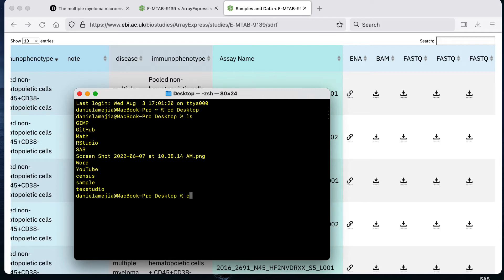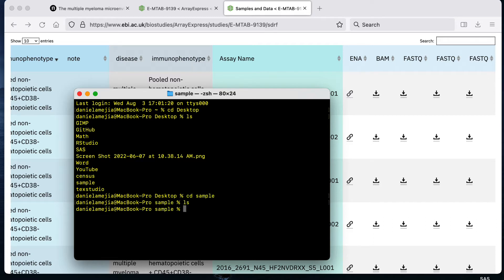If you haven't created that directory you can create a directory using mkdir and then the name of the folder. Since I already have created that folder I'm just going to cd into it which means just to change into that directory. Right now there's nothing in the directory and I want to download the files into this folder.